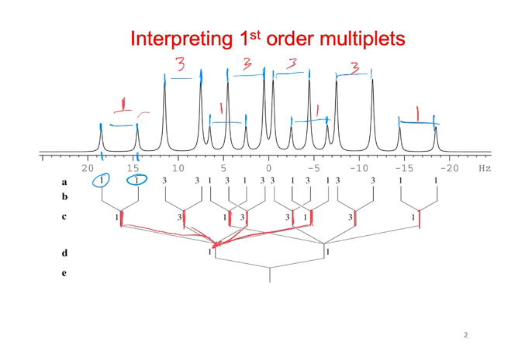And then we have one more big coupling. So if we looked from one doublet or something like that, so let's say from here, and we looked all the way through to here, I think it's to here. These would be the same left-hand piece of another quartet.